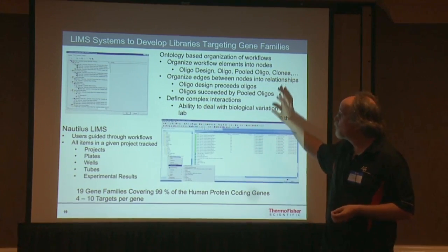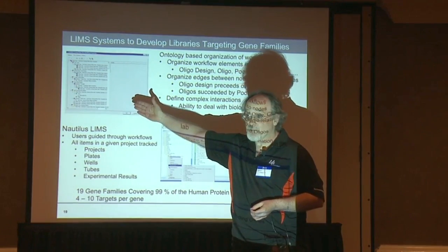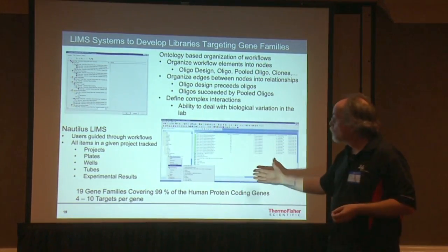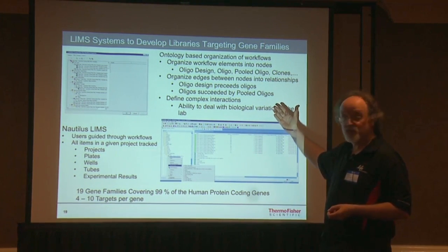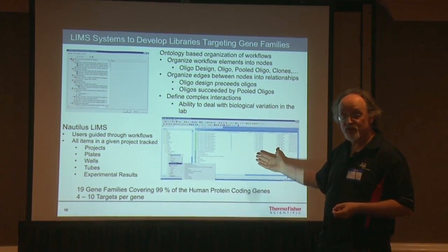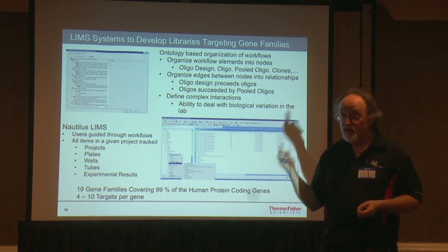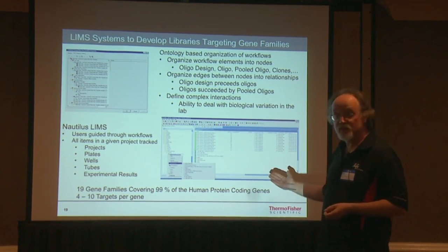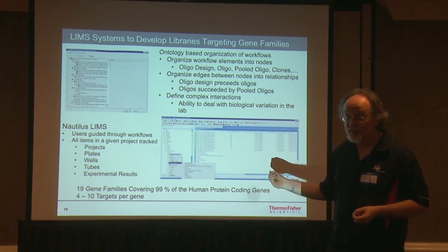Okay, and in many ways, whenever we were developing this workflow ourselves, as we were going through these individual steps, these are individual experimental steps which we're replicating in the software. What we're actually doing here is also tracking all of that and using these descriptions of how to do an assay or how to do an experiment, bringing that into our software and making sure that what we're generating is both, one, experimentally valid, and two, is actually able to be computed across. Okay, so we can be sure the results coming out of this are actually consistent with what we actually wanted to get in the first place.